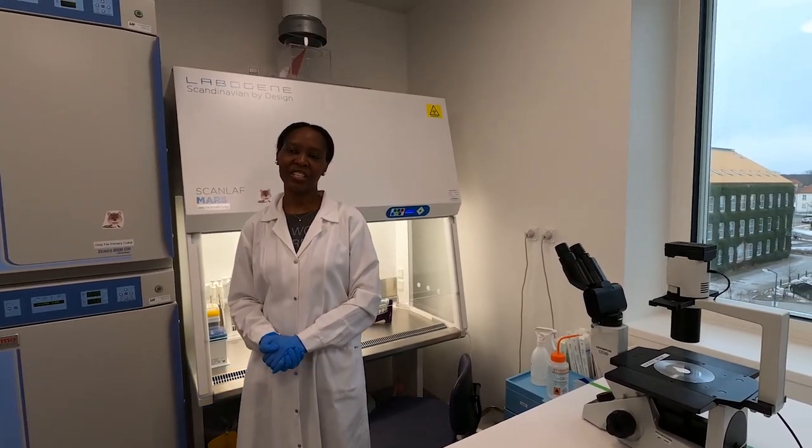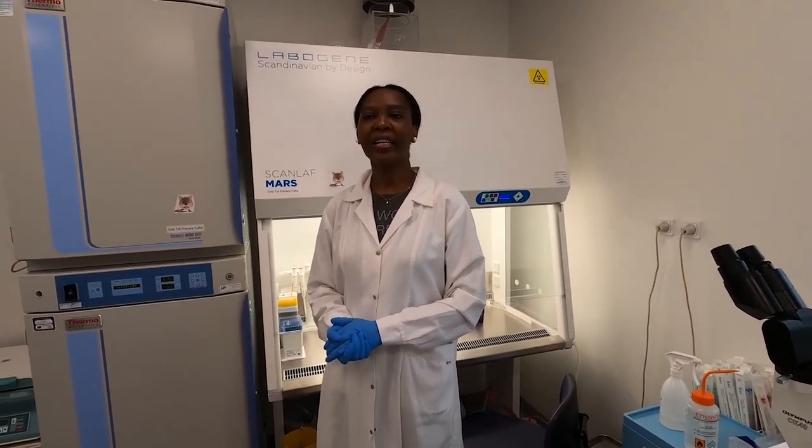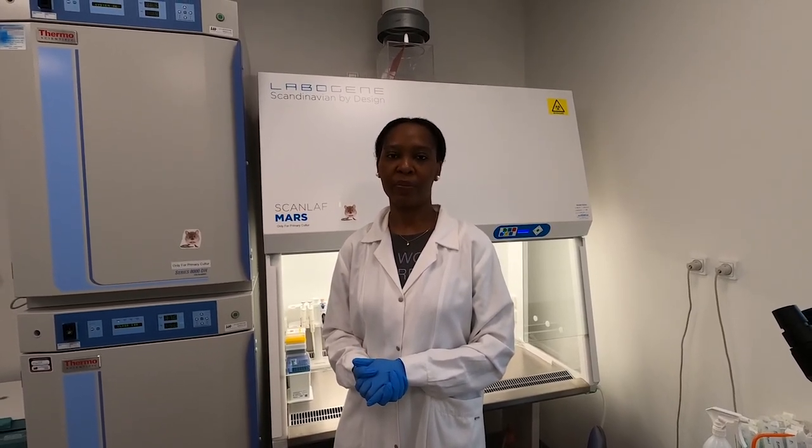My name is Lilian. I'm assistant professor here at the Department of Biomedicine in the Nykjaer's group. I'm originally from Sweden. As many of you already know, many neurological disorders have been characterized by morphological changes in the neurons. In order for me to be able to study these morphological changes, I culture cells, both the neurons and the other nerve cells. Once I have the cells in culture, I can then modify them either genetically or pharmacologically in order to see how these changes come about and how we can either reverse them or stop them.